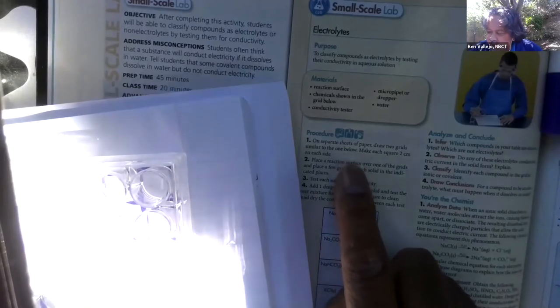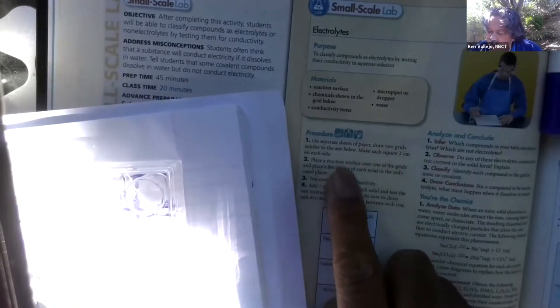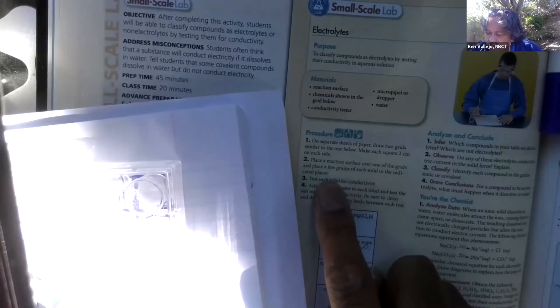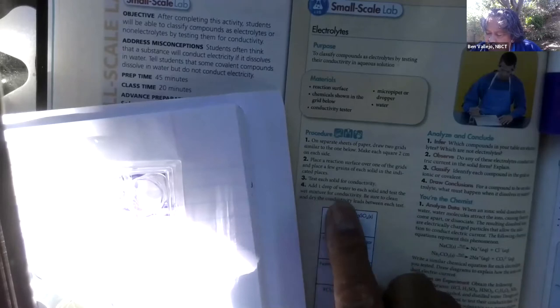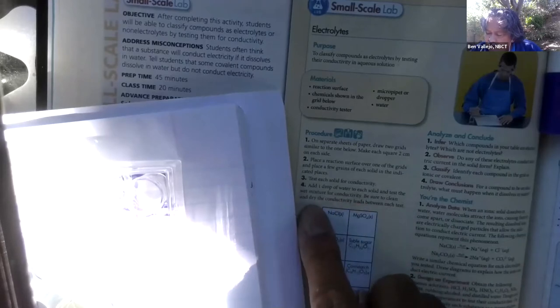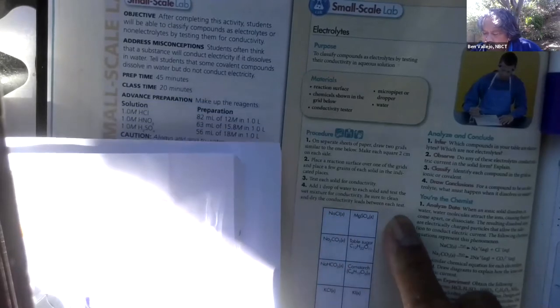It says, separate sheets of paper, draw two grids. We did that. Place a reaction surface over one of the grids and place a few grains of each salt in the indicated spaces. Test each salt for conductivity. Add a drop of water to each solid. Test the wet mixture for conductivity. Be sure to clean and dry the conductivity leads between each test. Okay, so we're checking for conductivity of these solids.